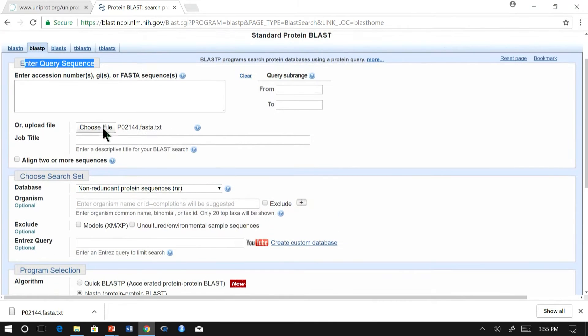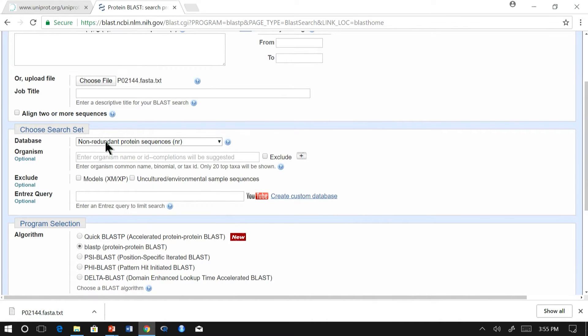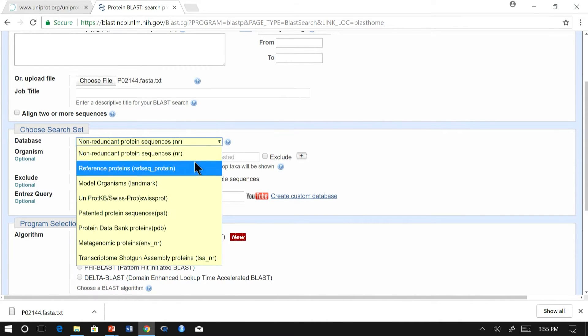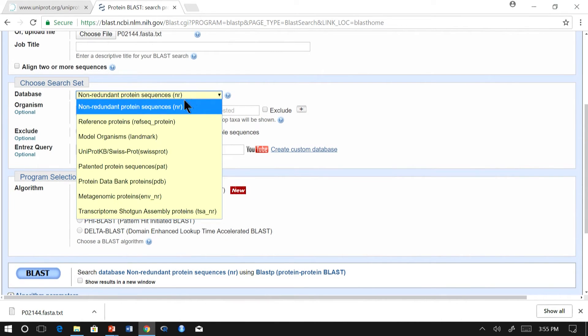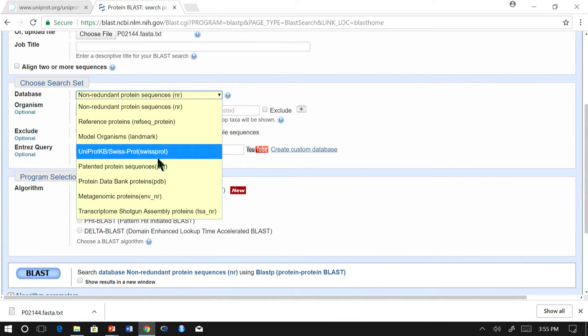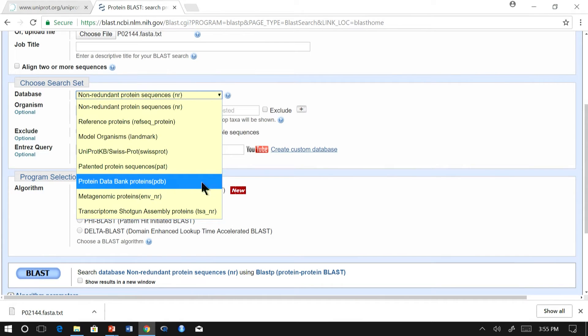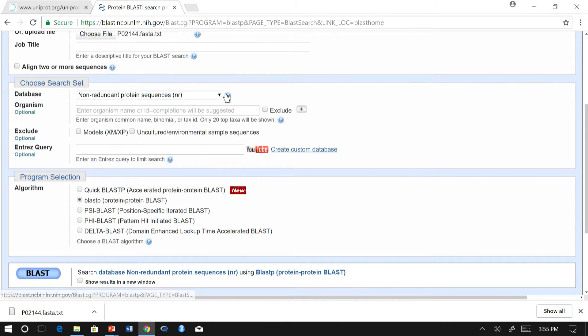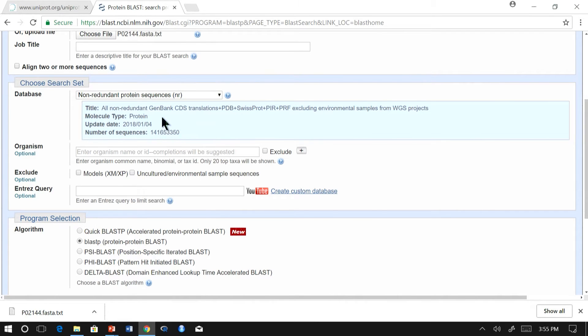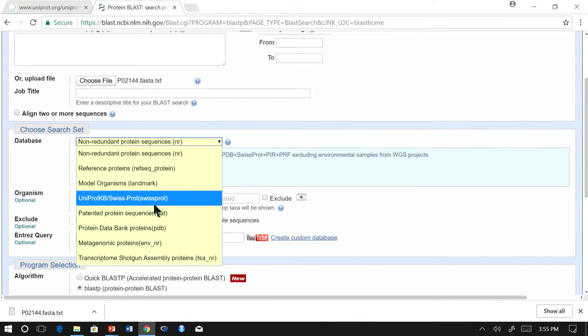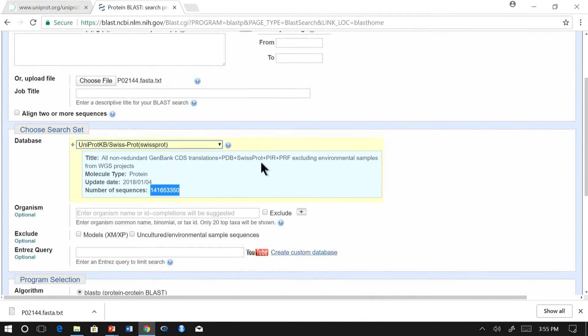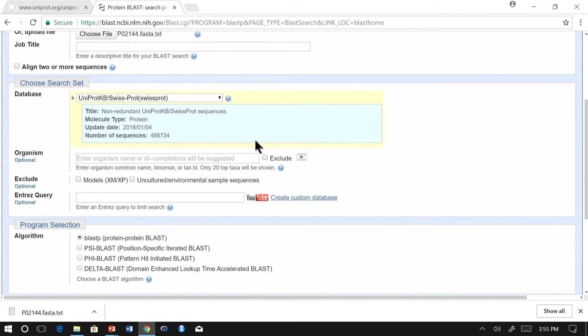Now that I have chosen the query sequence, let me choose the target sequence. There are different target databases here: NR, UniProt, RefSeq, SwissProt, PDB, etc. If you are confused about the databases, just click on the help. You will get the details about the database and the number of sequences which are there. I will choose UniProt because it contains reviewed sequences and number of sequences will be very less.